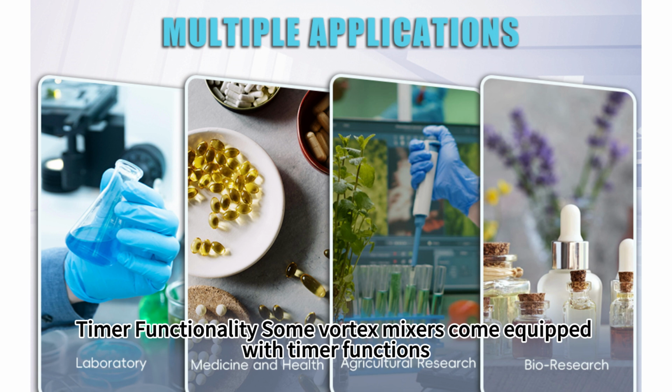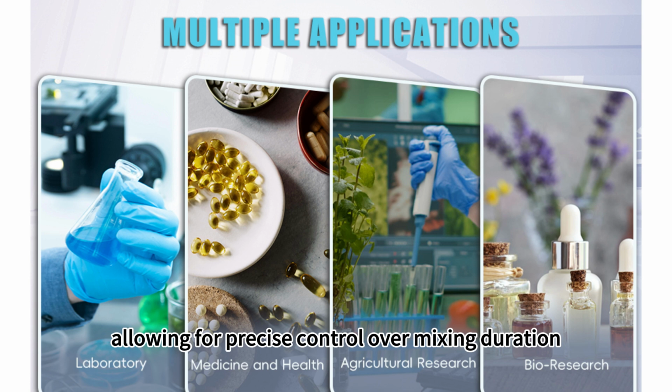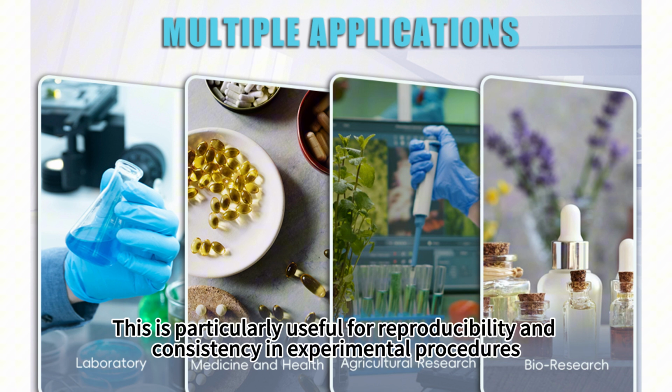Timer functionality. Some Vortex mixers come equipped with timer functions, allowing for precise control over mixing duration. This is particularly useful for reproducibility and consistency in experimental procedures.